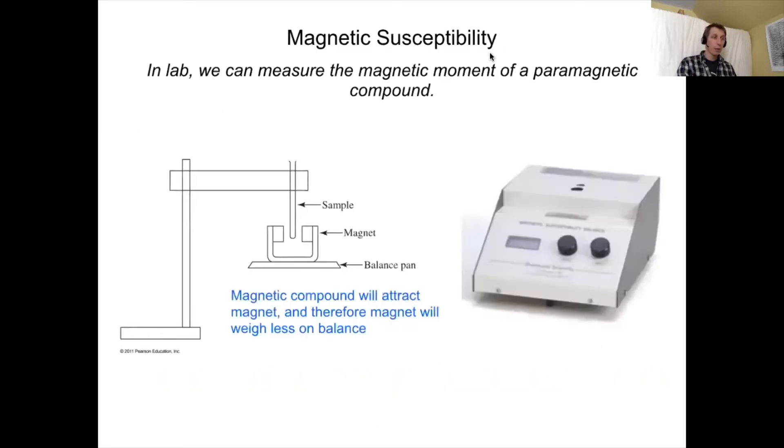First a little bit about our magnetic susceptibility balance that you used in lab. It's sometimes called a Johnson-Mathie balance. A simple schematic of the device can be shown here. Basically what we have is a support system with a bar going across and a spot to insert our tube. Here's your sample tube that we all used in lab. A lot of this is supported by thin metal strings which is why it's so important to be delicate with this balance because any movement will start this swaying or bend the string and then it won't work as well.